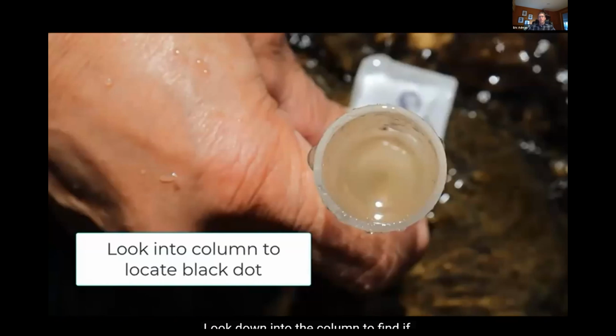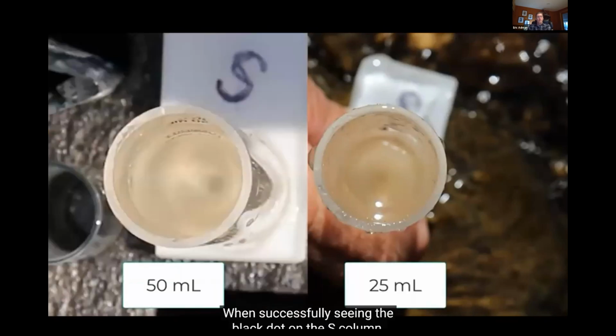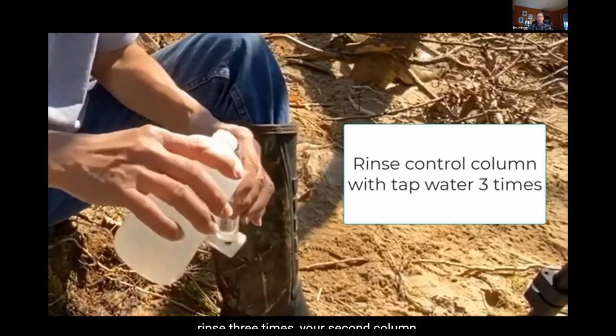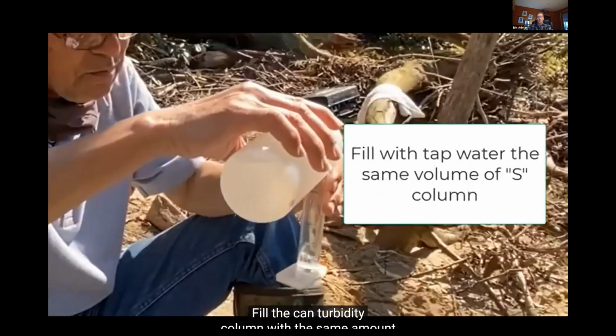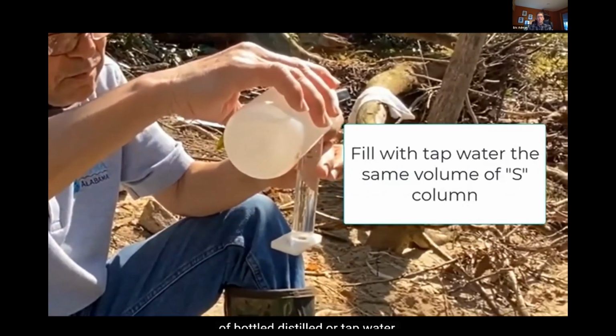Look down into the column to find if, with that sample volume, you can see the black dot on the bottom of the column. When successfully seeing the black dot on the S column, rinse 3 times your second column, the one labeled C for control or T for tap water. Fill the second turbidity column with the same amount of bottled, distilled, or tap water.